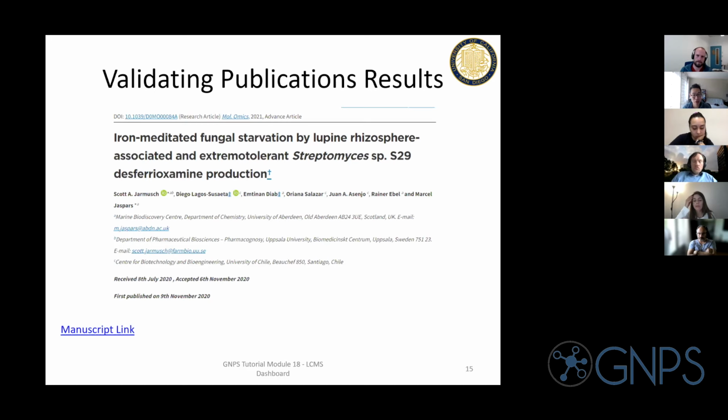So it's kind of a validation that everything up and down the chain matches. And so what I'm going to walk you through right now is, given that you see a new paper, you see that they've included an accession number for that particular data set, how do we go and start exploring that and validating that?